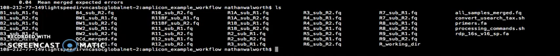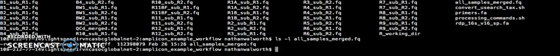And if you do an ls and you look inside your folder, now we can see all samples merge.fq. If you do ls -l all samples merge.fq, you can get a file size. And that file size, because it's integrating all of the different sequences from all the different samples, should indeed be a good amount bigger than these .fq file sizes, and indeed it is. As you can see right here, it's significantly bigger than a lot of these files.